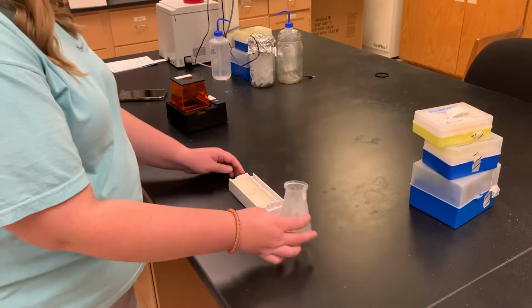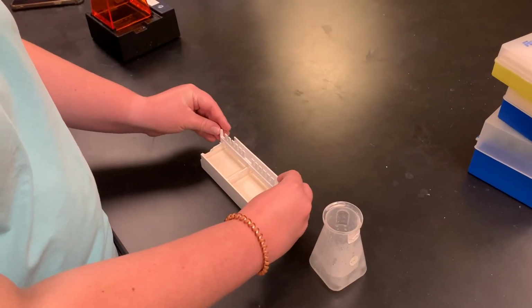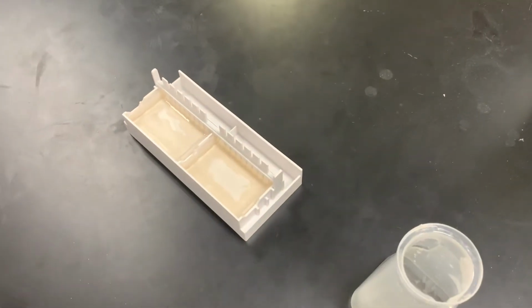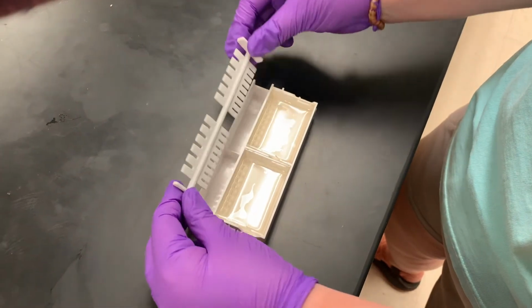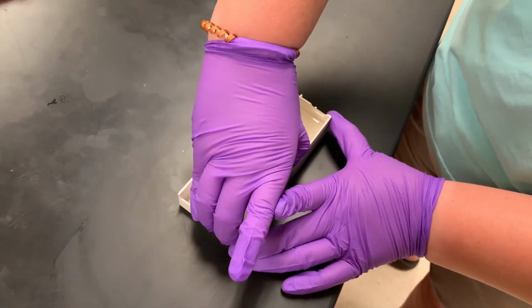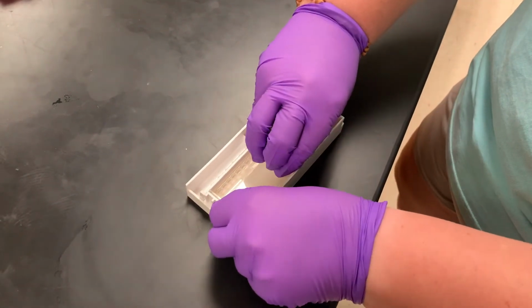Add the comb to the filled gel mold. The smaller side is preferred, but you can use the larger side as well. Leave the gel to set for 15 to 20 minutes. When the gel is set, gently remove the comb and remove 1 gel from the mold, making sure not to break it or get fingerprints on the surface.